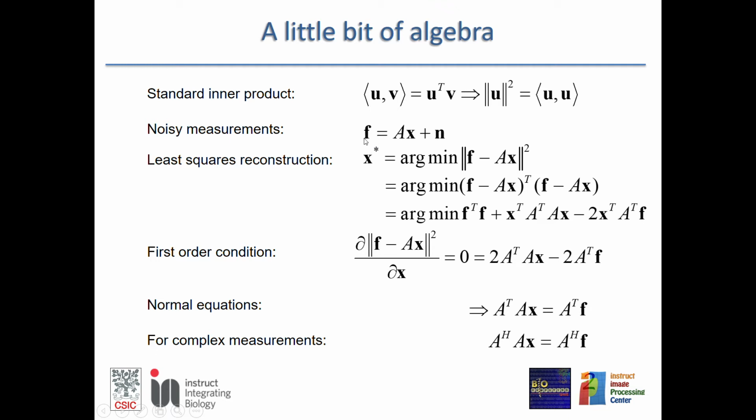Those are your projections, and these projections are obtained by taking an object that is the 3D volume and applying some operator. This operator is making the projection, and if necessary is applying also the CTF. So it depends on whether you are considering the CTF for the 3D reconstruction or not. And then there is some noise on top of this ideal projection.